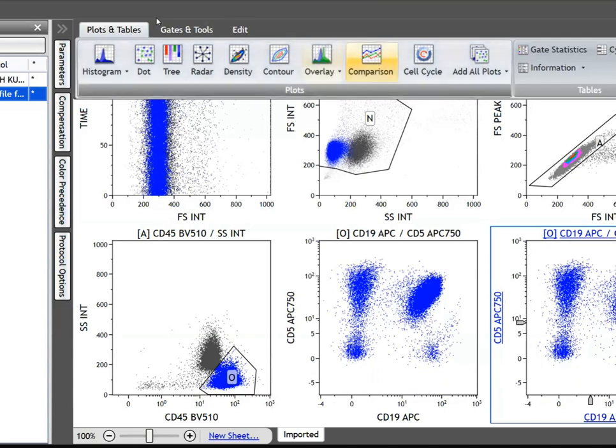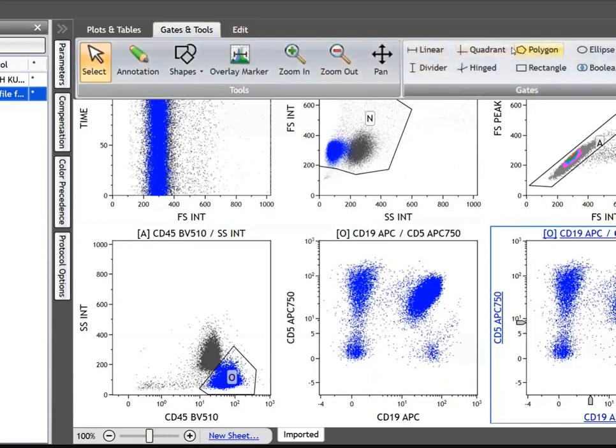Now I'll gate. I have multiple options to gate. If I'm missing something, please let me know, because I may forget some things, and later in the night I will remember that I didn't describe it. There are multiple ways of gating. One, as I told you, is a polygonal gate, which is a linear manual gating like this, manually selecting the region.